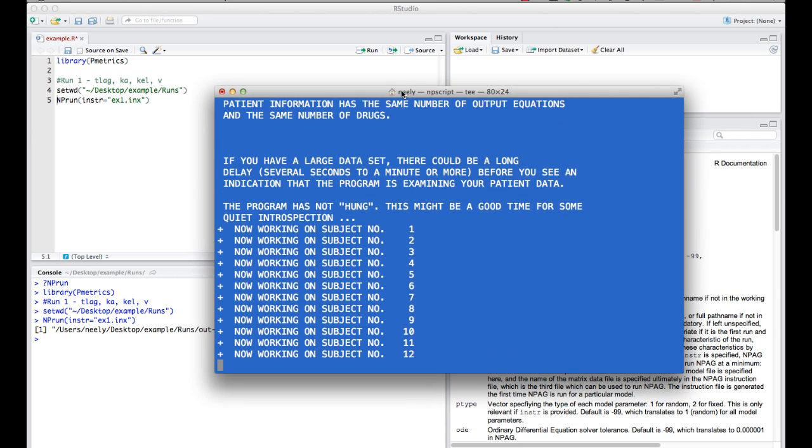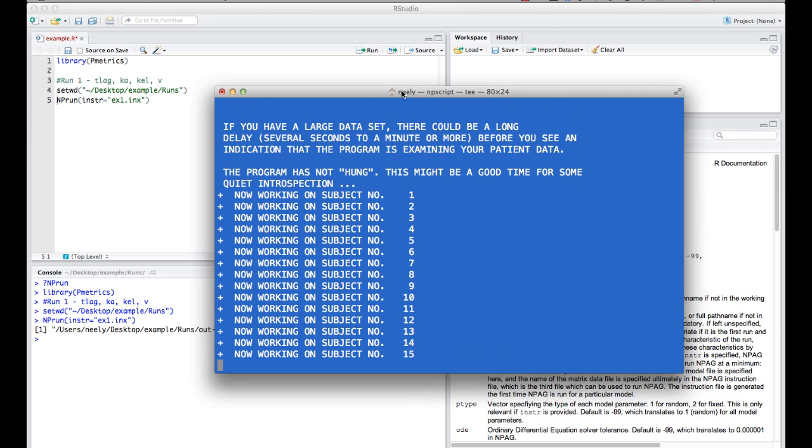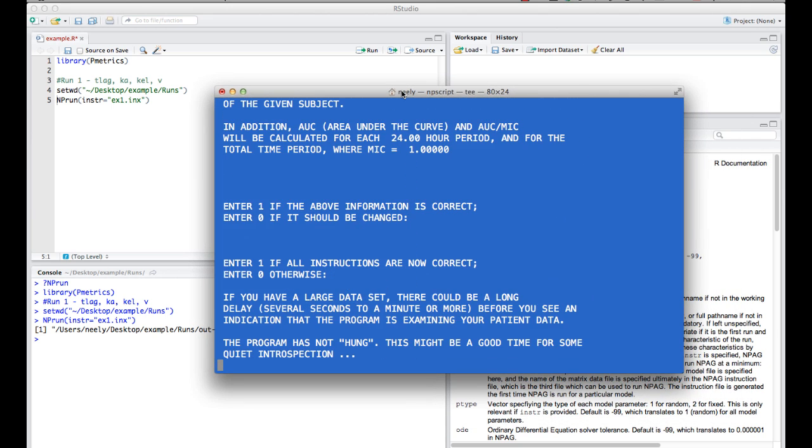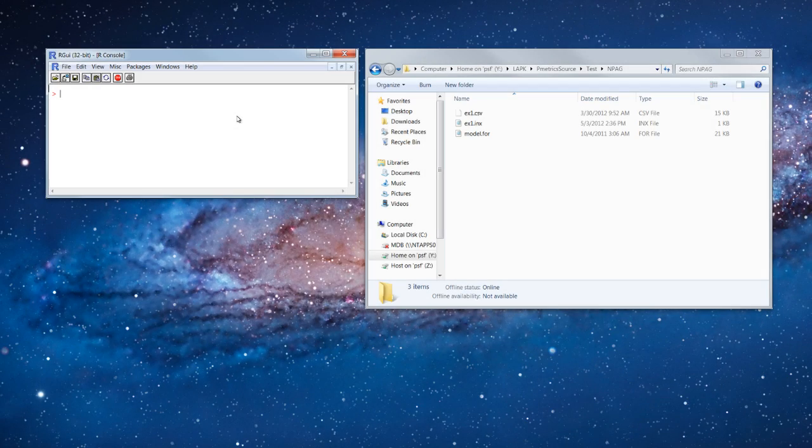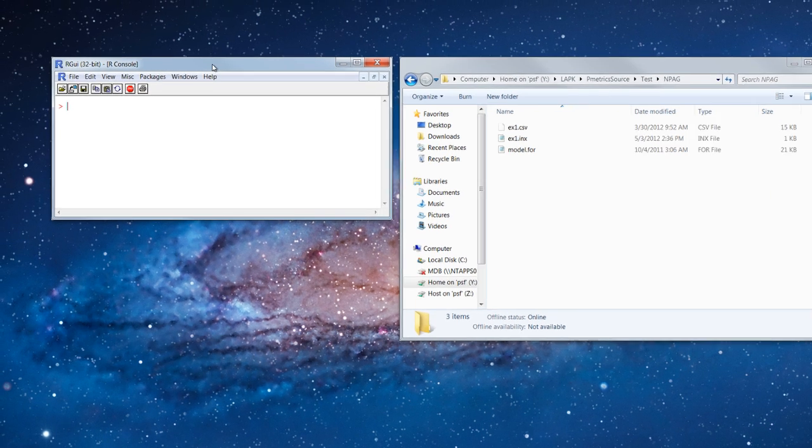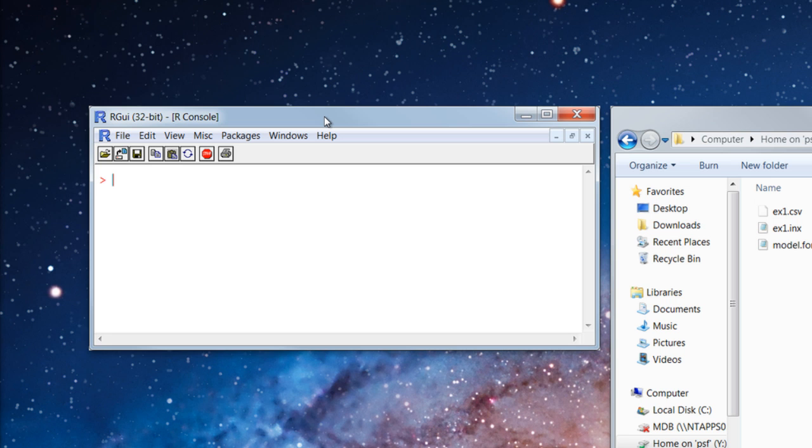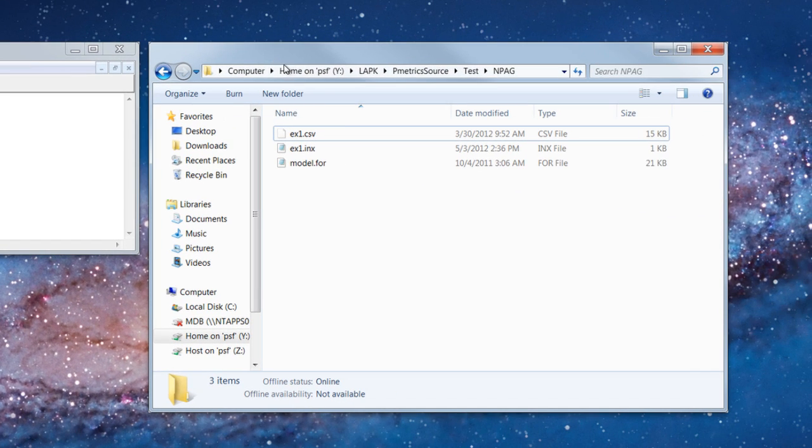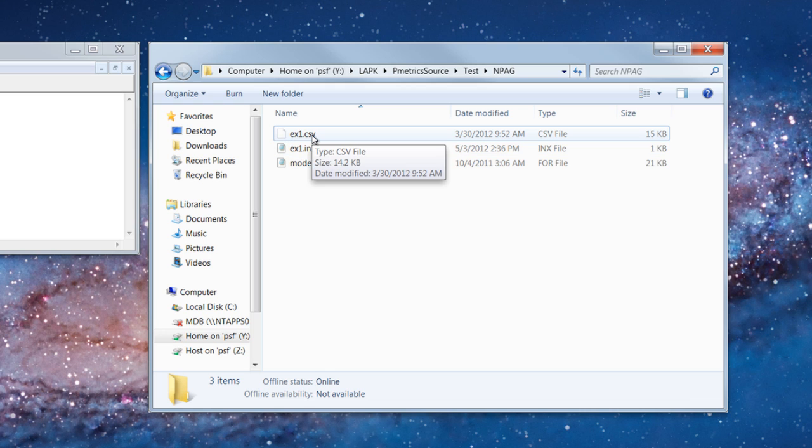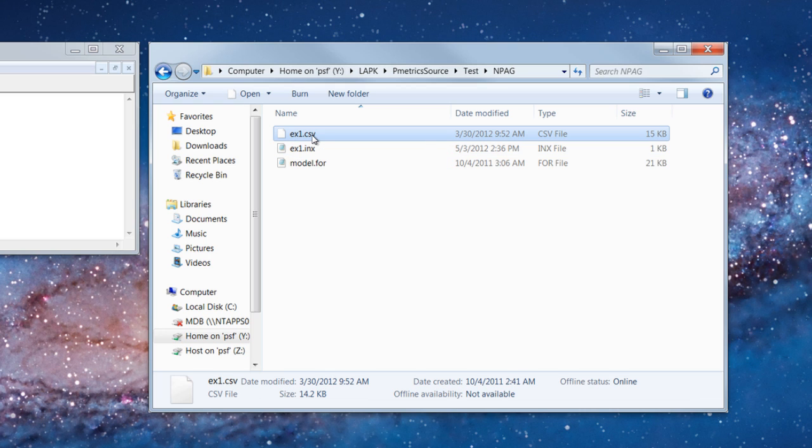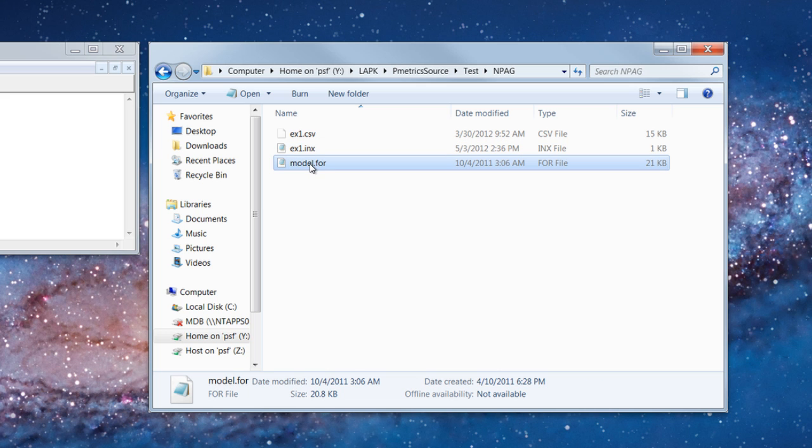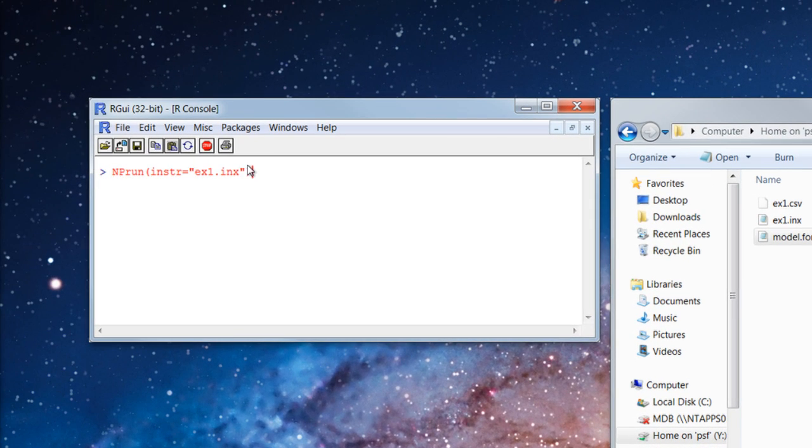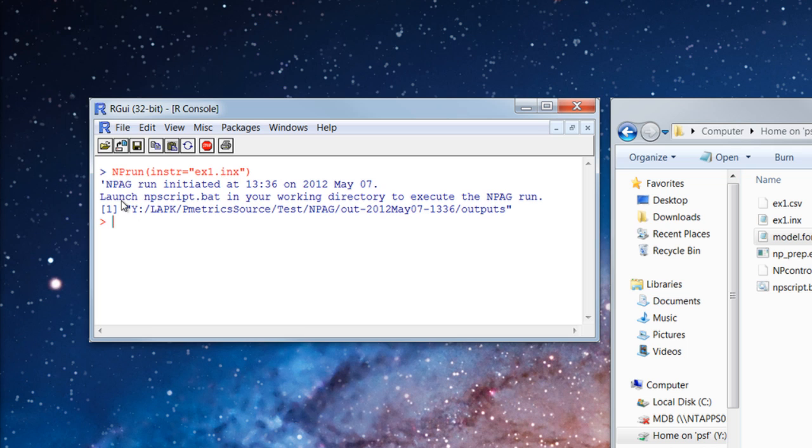And you'll see a Unix window pop up, and the run will be initiated. Now, the behavior on Windows is a little different. So, while this is running, I'm going to slip over and show you what it looks like in Windows. Okay, now we're going to see the differences in behavior on Windows versus the Macintosh. Over here, I have my R console window. And next to it open is a window that shows my working directory. And in that working directory, I have three files: the data file, the instruction file, and the model file. If I go back to my R console and I execute the command nprun and give it the instruction file name, you'll see that it tells you that npegrun was initiated with a time and date stamp, and then you're supposed to launch this npscript.bat file that is now in your working directory to execute the npegrun.